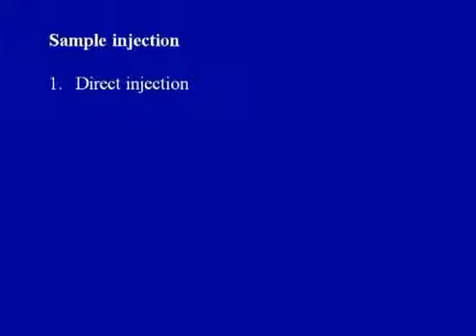Now, as carrier gas goes on, the next thing is the sample injection. Like I showed you, many times certain chemistry is involved to prepare the sample, and maybe derivatization or other things might be required to vaporize the sample, because not all the compounds could be vaporized. So, this is a limitation of gas chromatograph. When we do sample injection, the sample has to be vaporized, so that it can partition between the stationary liquid phase and the mobile gas phase.